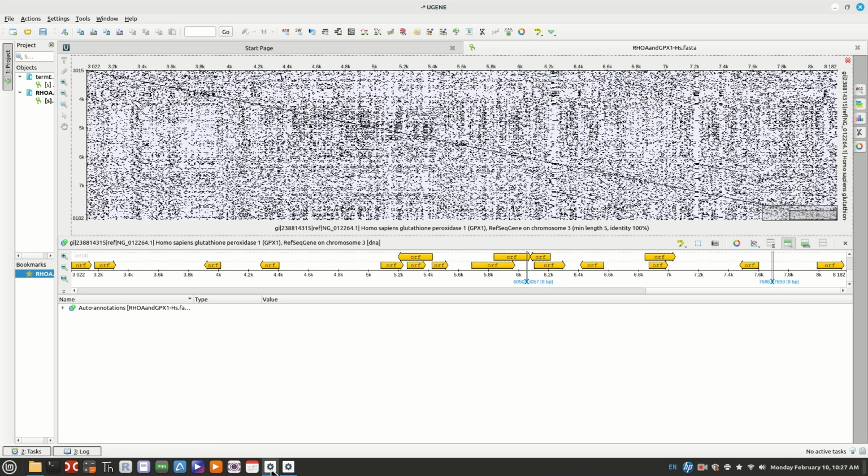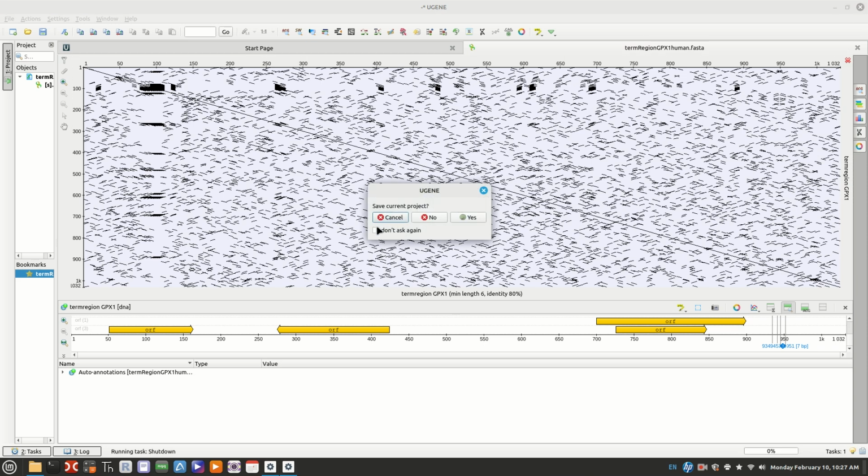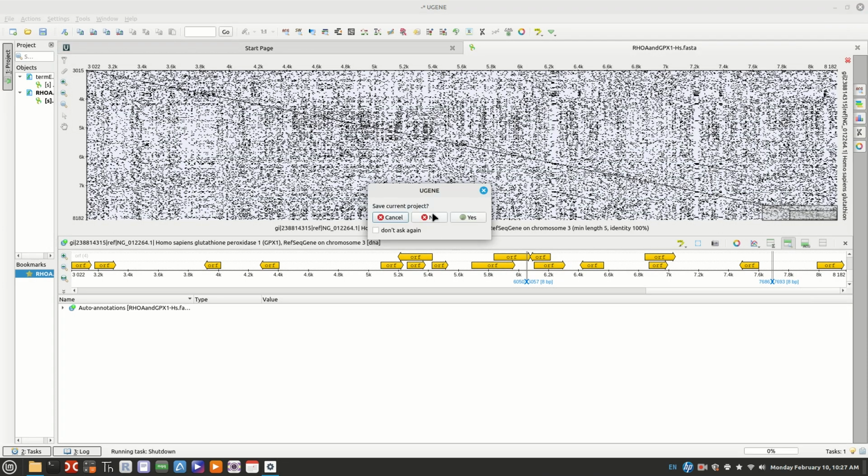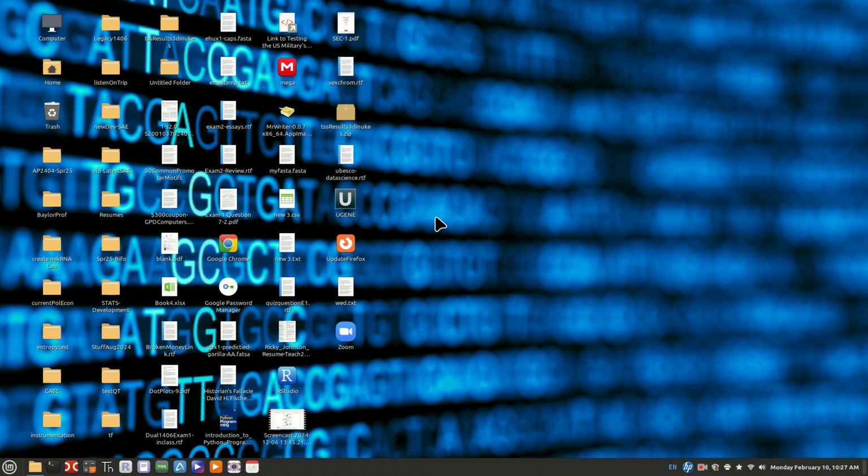So it was about 800 past the, let's see, past the polyadenylation signal, somewhere in there. All right, I just wanted to show you that. That's how you find a terminator, and how you use dot plot. This is the main way you would use dot plot. Dot plot is also good for finding splicing sites, or if you have the mRNA.